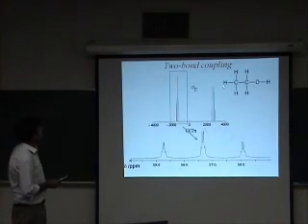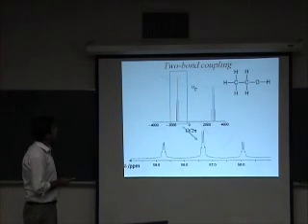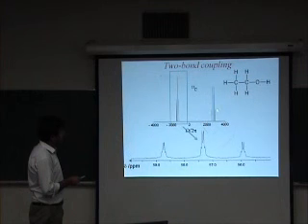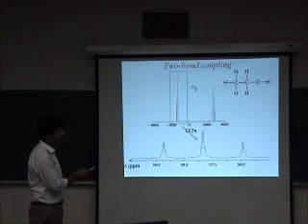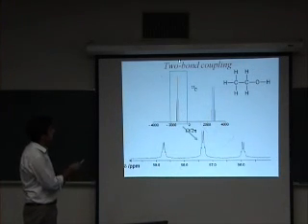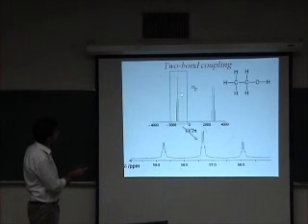अच्छा, अब आप देखिए कि जाहिर है ये पीक कार्बन-13 की मेथिल कार्बन की वजह से है, क्योंकि it is being coupled to 3 protons. So this is the quartet, this is the triplet. अब आप ये ट्रिपलेट देखें, इसका फाइनल स्ट्रक्चर देखें.